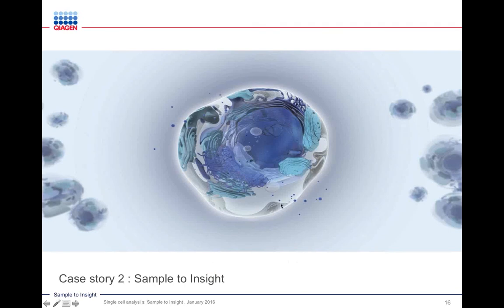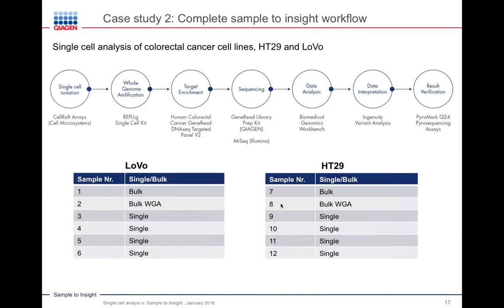So the next case story is focusing on 2 different cancer samples. These are cancer samples that are from 2 different colon cancer cell lines.